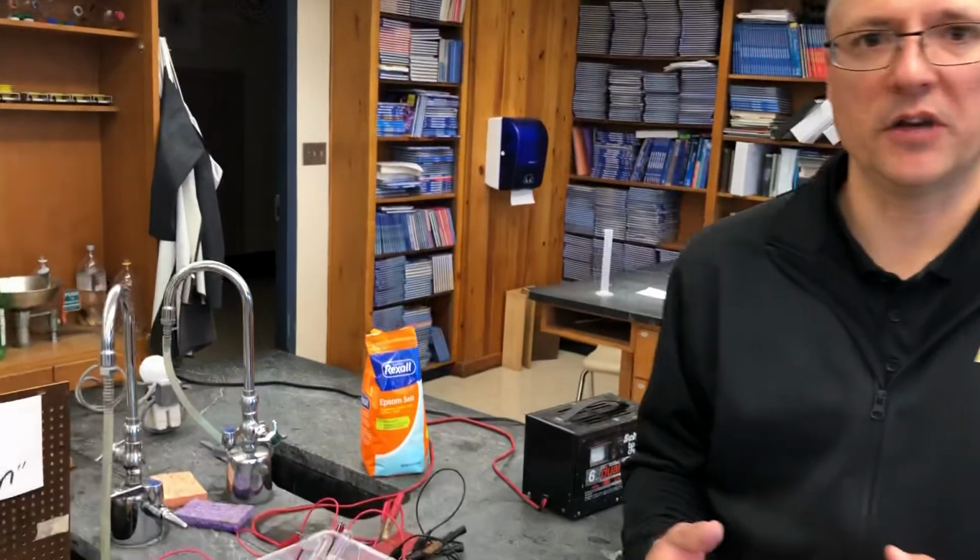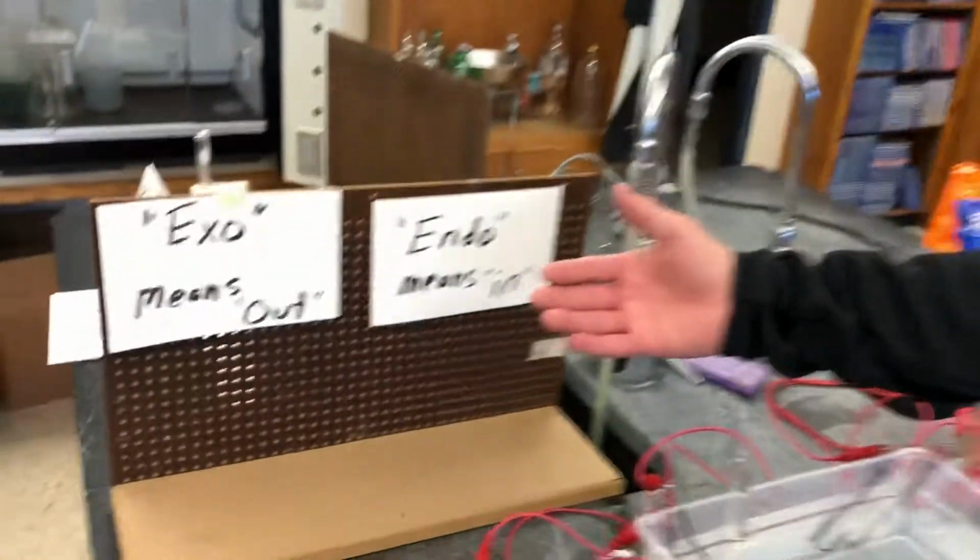This is part one of the energy reactions lab. Energy reactions refers to endothermic and exothermic reactions. Thermic reactions, the word thermic pertains to heat energy. And heat energy either goes into the system of the reaction or it comes out of the system of the reaction. Now we have two types of reactions, exothermic and endothermic.